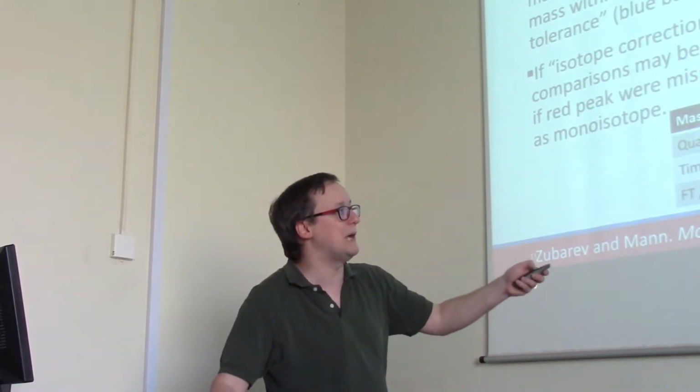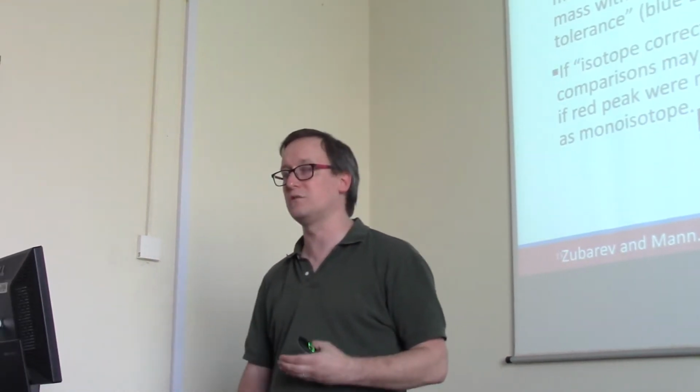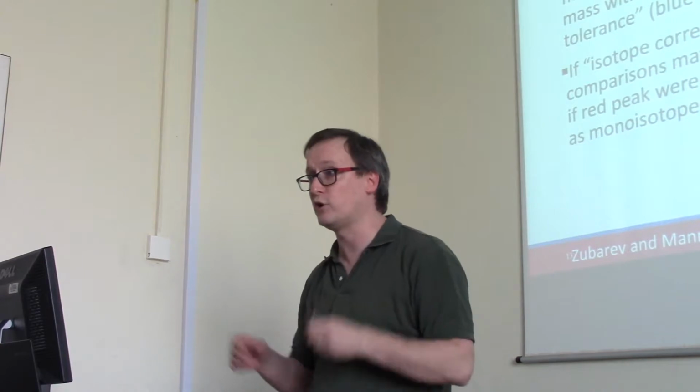So things have gotten a whole lot better since the bad old days when we only had low resolution measurements, low mass accuracy measurements for our peptides.